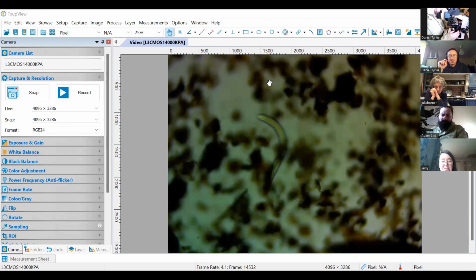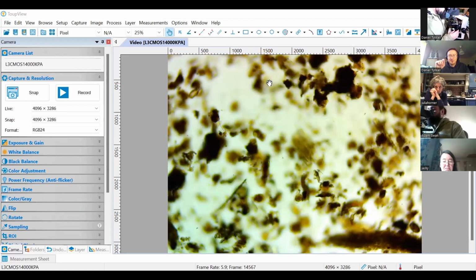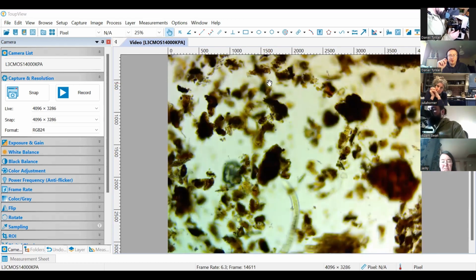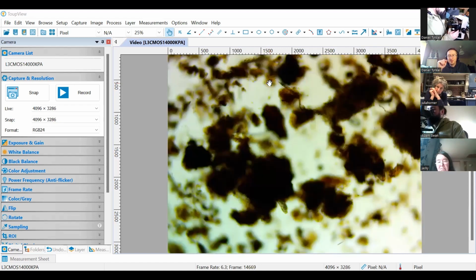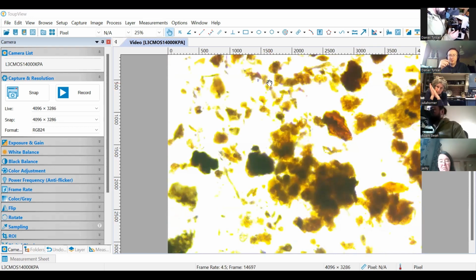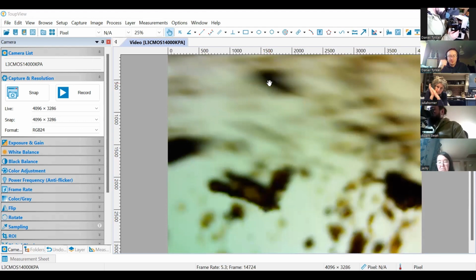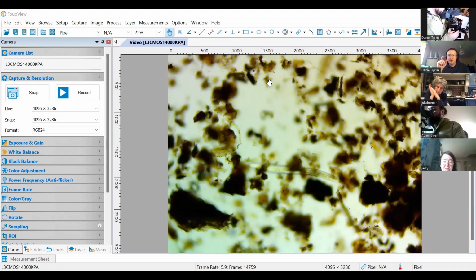The challenge there is that the air gap between the glass and the objective is already affecting the image that you're getting, and so you use that with a drop of oil. First of all, we don't need that kind of magnification when we're identifying organisms in the soil. And second, it's a hassle. You now have to clean that oil off your pieces of glass every time, and you're not really increasing your effectiveness with these organisms. You can identify them at 400 times.